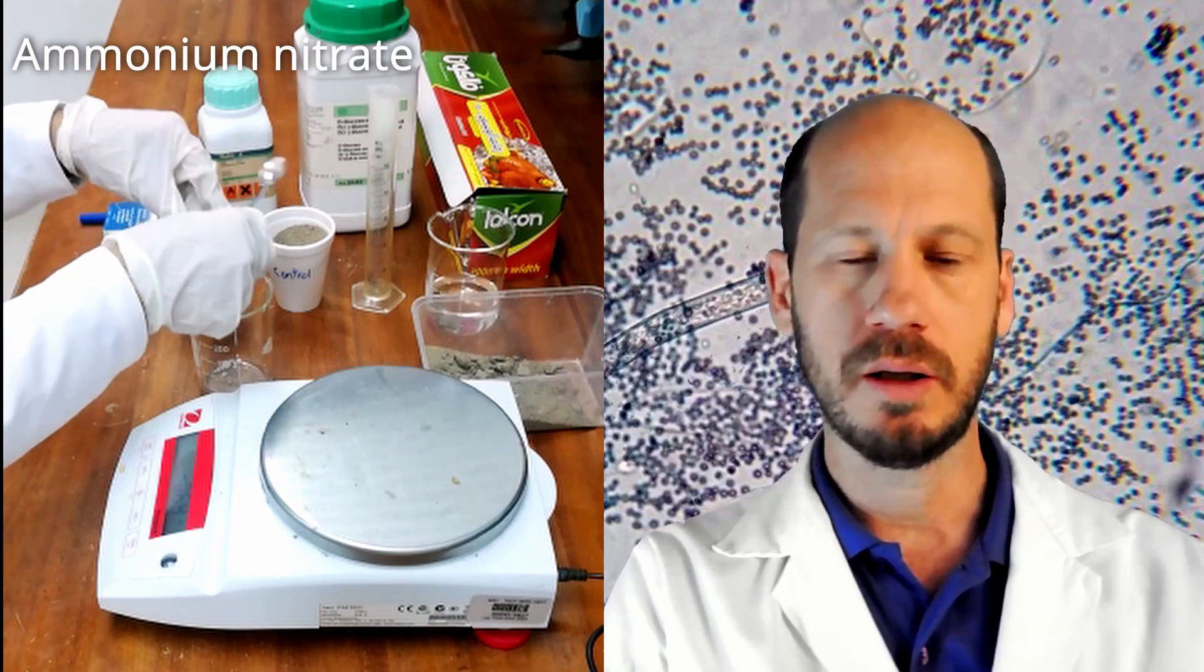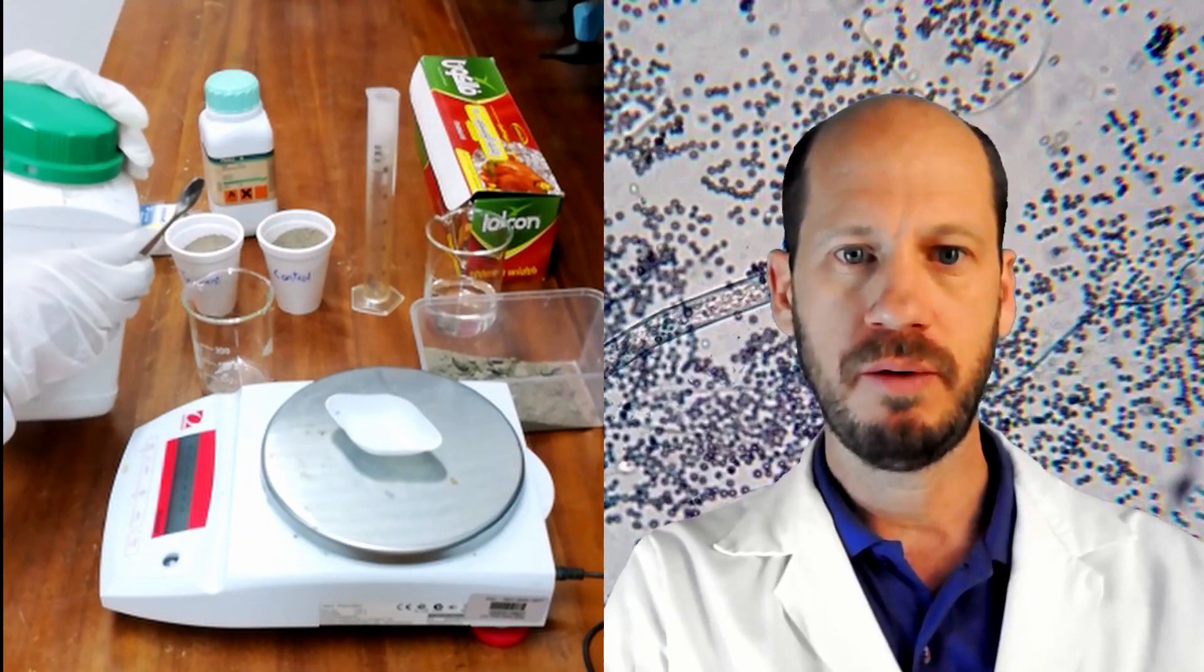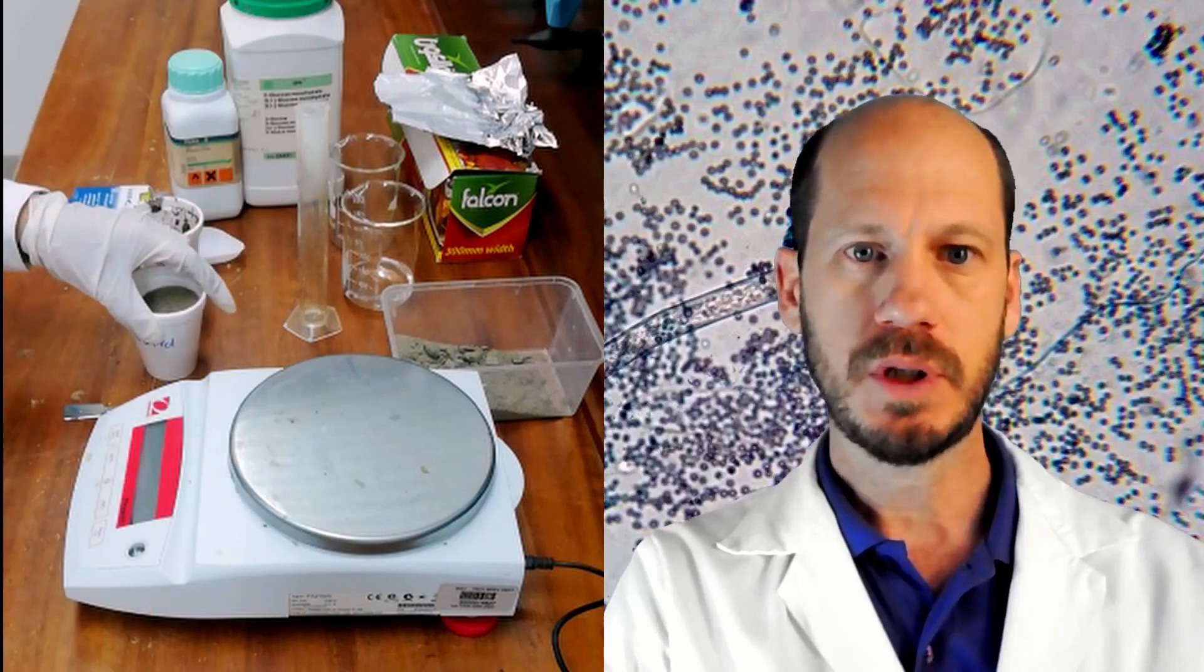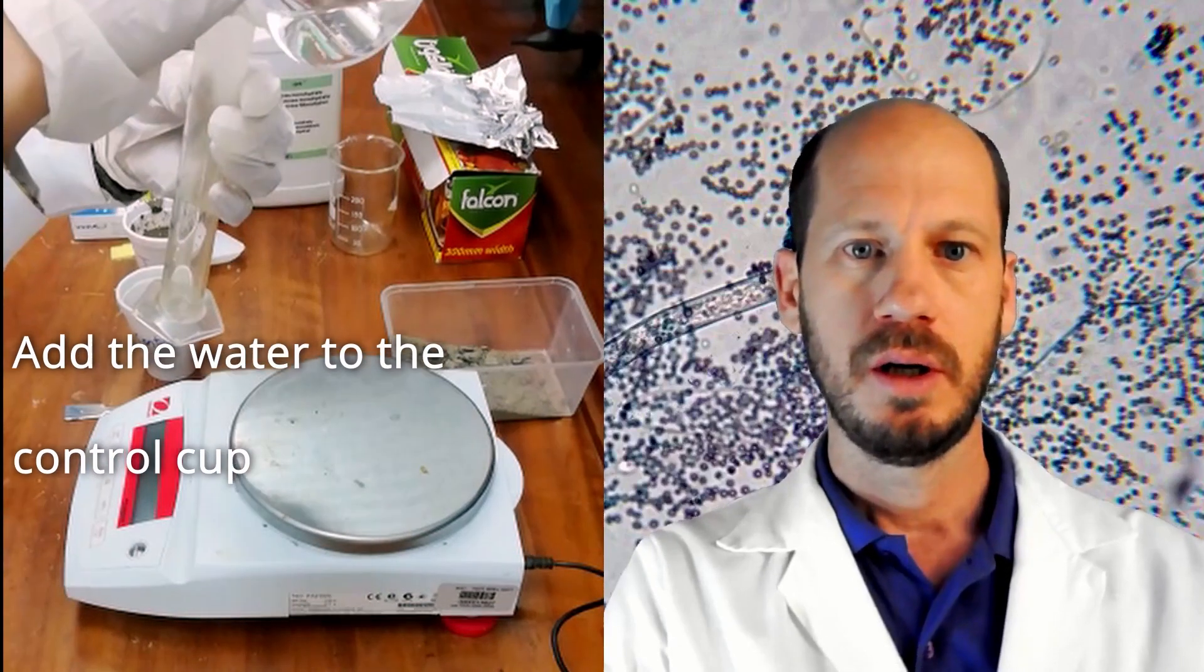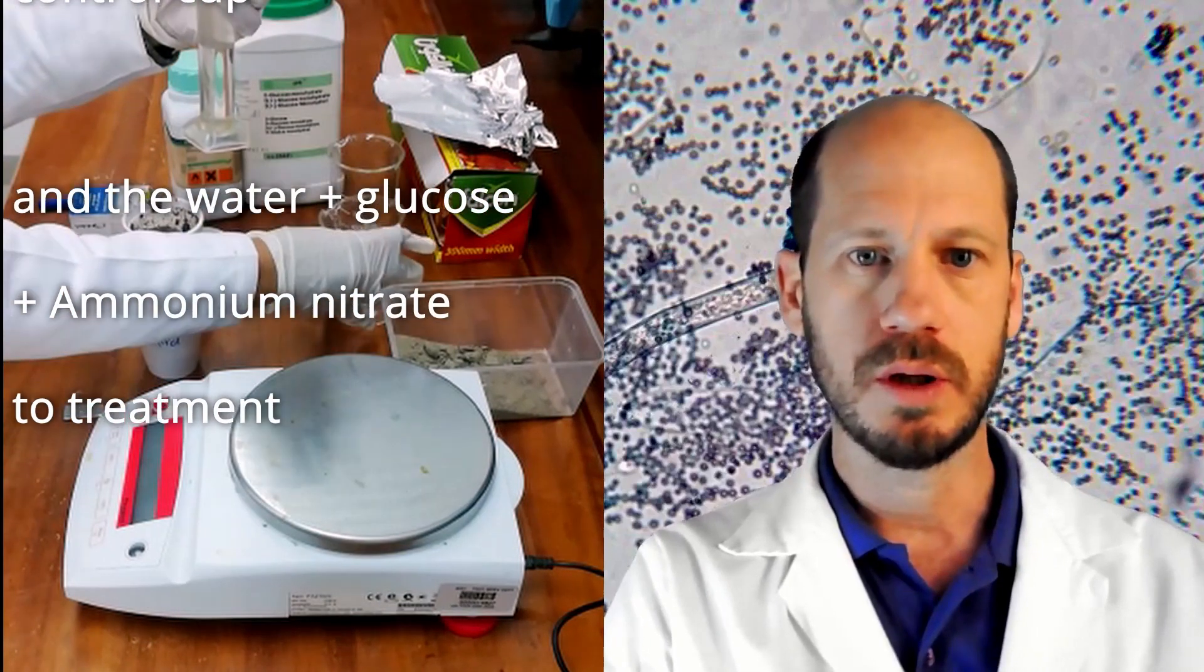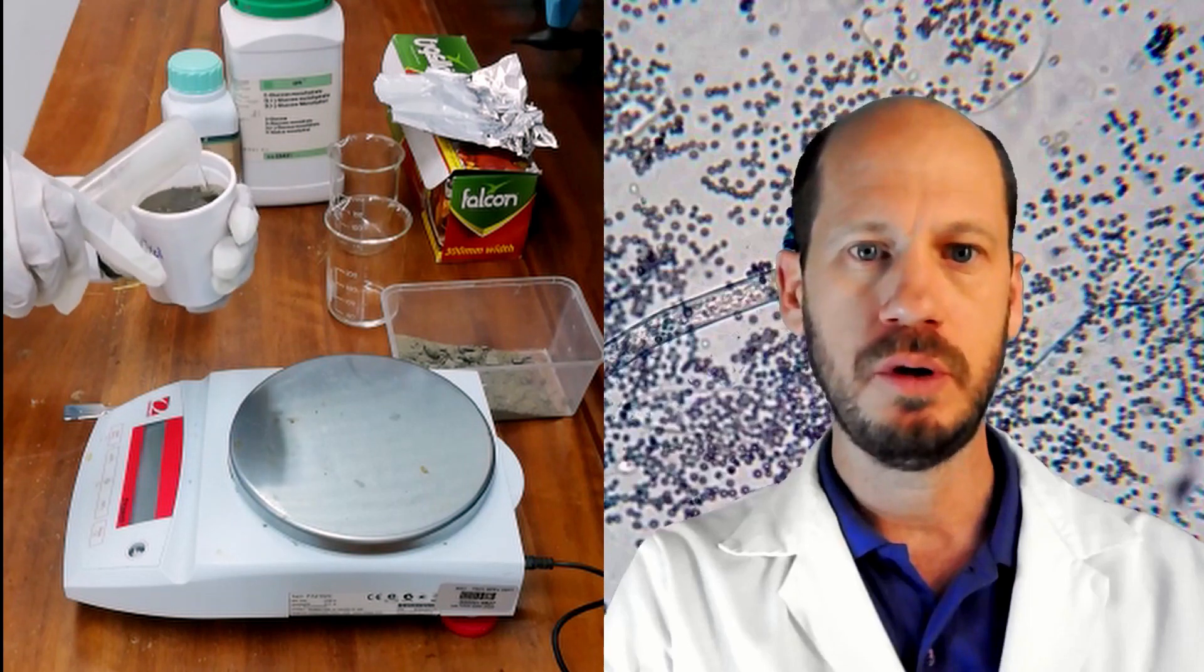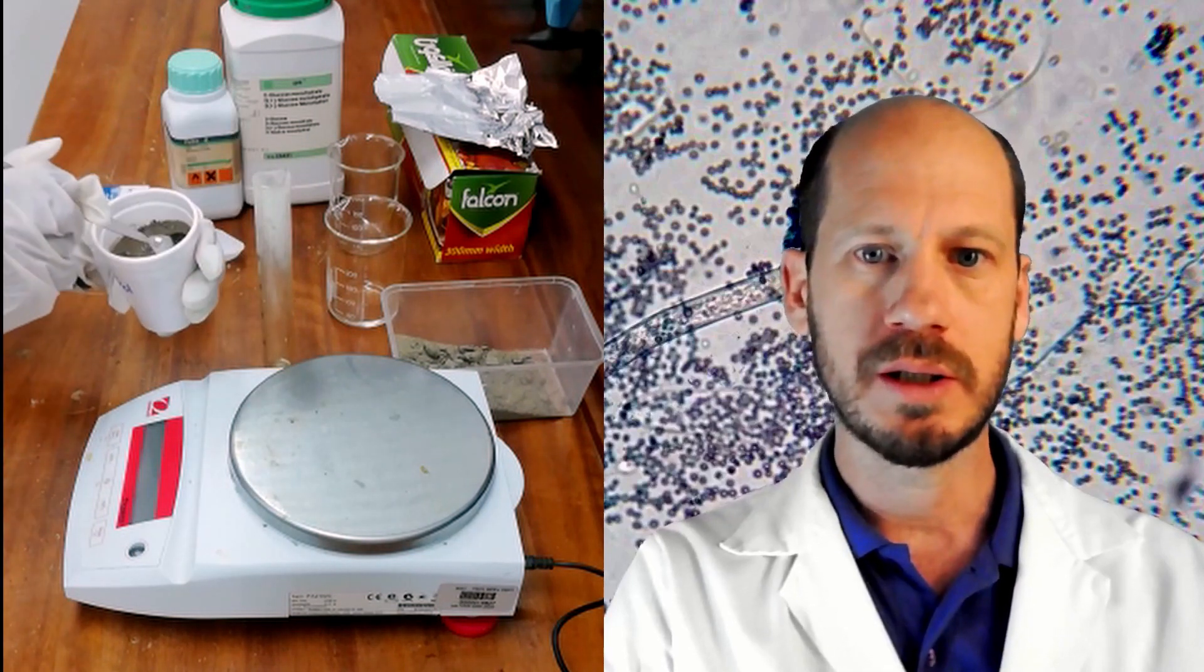Here we are weighing the glucose and the ammonium nitrate to mix with the water before adding this water to the soil and moistening the soil. Here measuring in the cylinder the water for the control and slowly adding and mixing this water with the soil for preparing the soil for incubation. We are incubating these soils for one week at room temperature and waiting for those microbes to grow in contact with the slide.